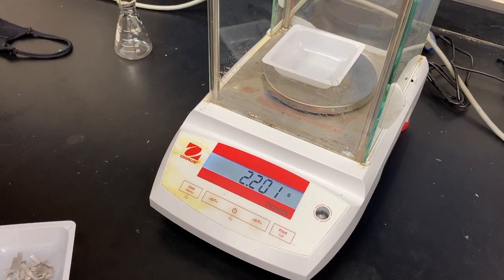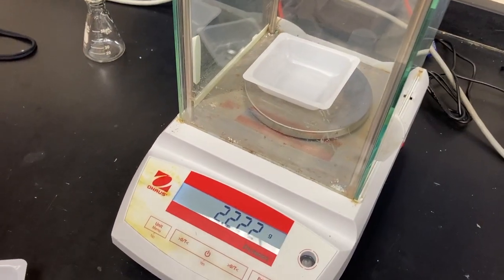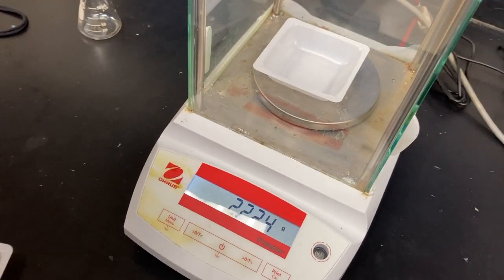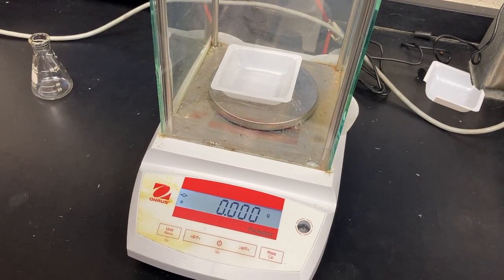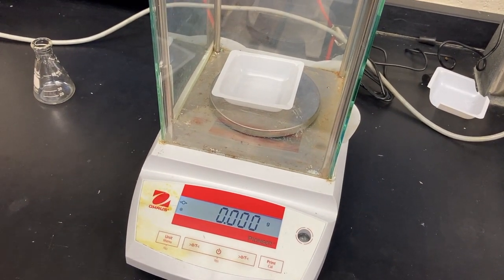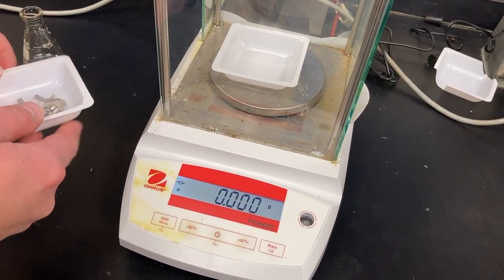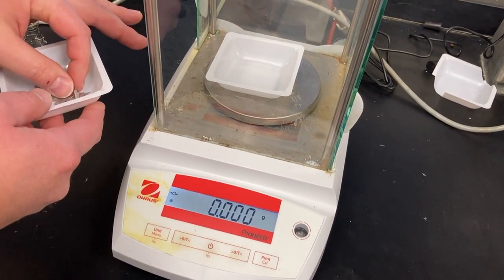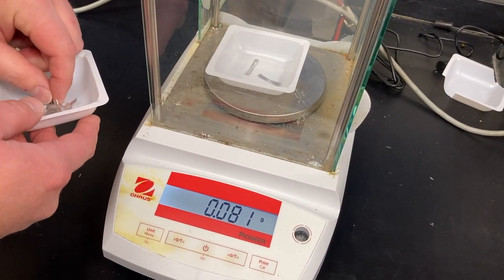So now let's weigh our magnesium. You might be thinking that's not magnesium, that's just a plastic dish. We call it a weigh boat. What we're going to do though is we're going to zero that out. Tell the scale not to regard that as a mass, because we want to systematically add magnesium pieces. Now the lab says we should have about 0.2 grams.